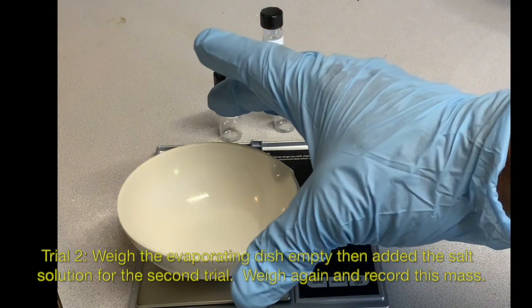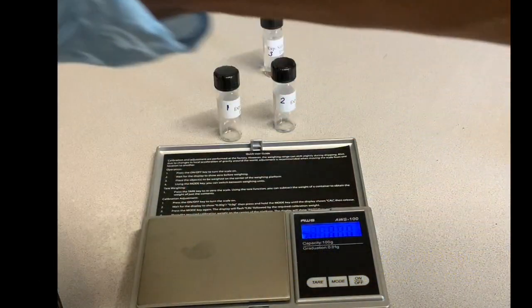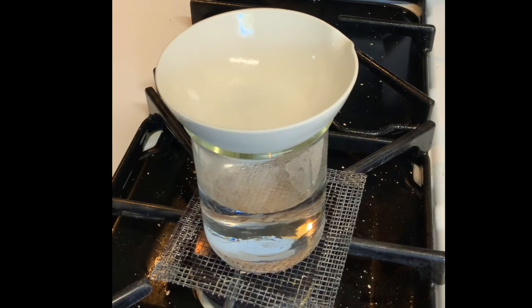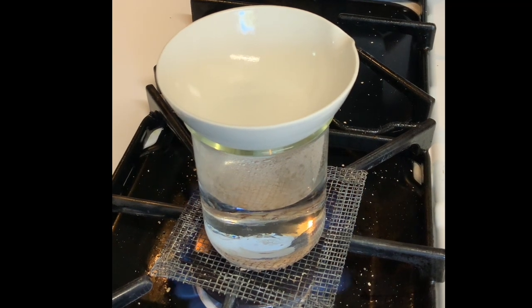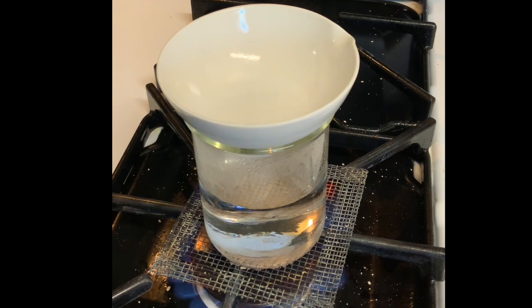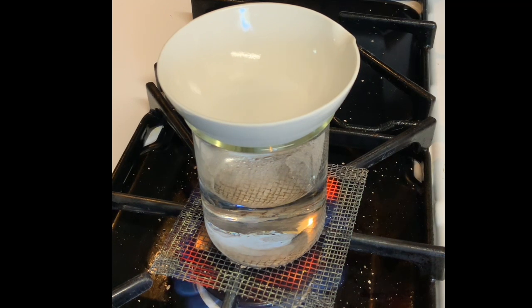Next, I'm going to take the evaporating dish with the salt solution and place it over my beaker of water again, and then repeat the experiment. So I'm just going to turn this on and then allow the boiling water to evaporate the salt solution.